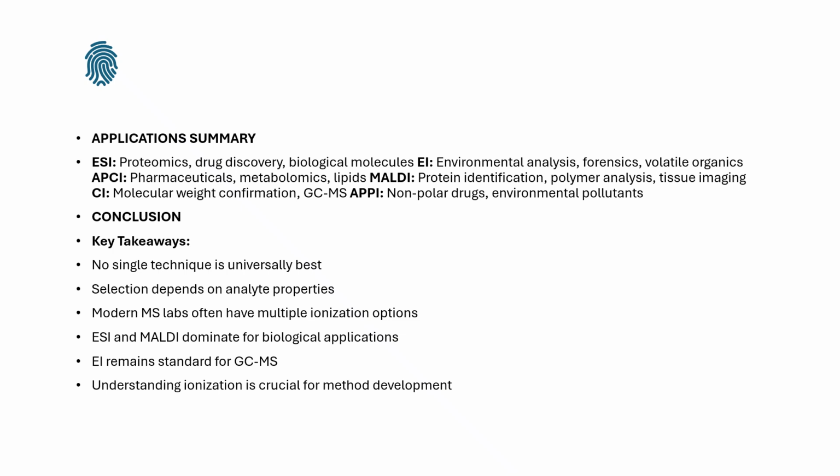And finally, understanding ionization isn't just academic. It's absolutely crucial for developing good methods and getting reliable results. The better you understand these techniques, the better analyst you'll be. You'll know when a method isn't working because you're using the wrong ionization technique, and you'll know how to fix it.